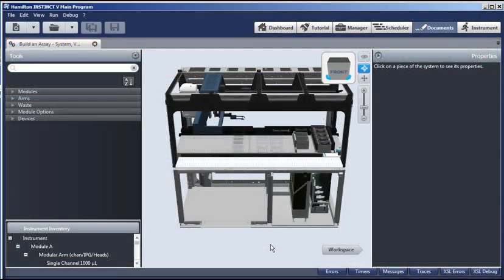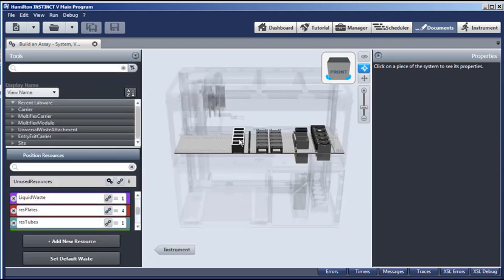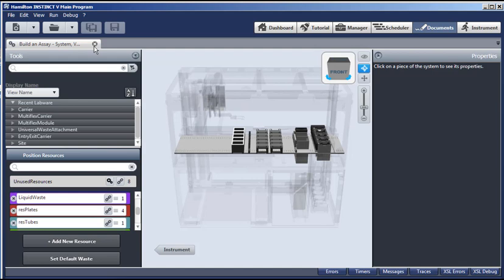And after it opens, use the toggle buttons to go back and forth between this instrument view, which is mostly hardware, and the workspace view, which is mostly carriers or our labware. Now, let's close this document and see how to create a new one just like it.